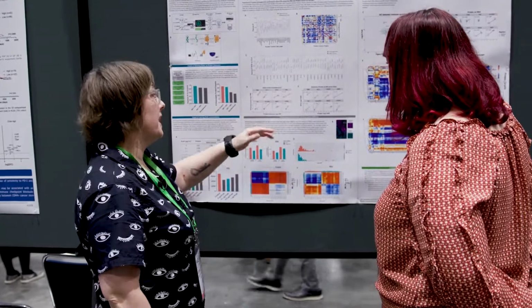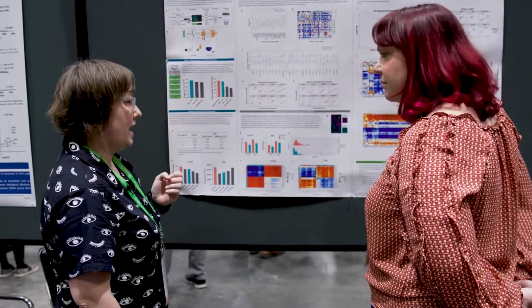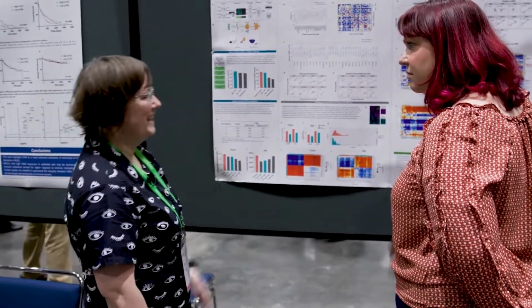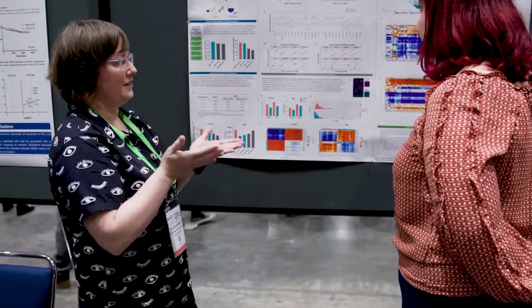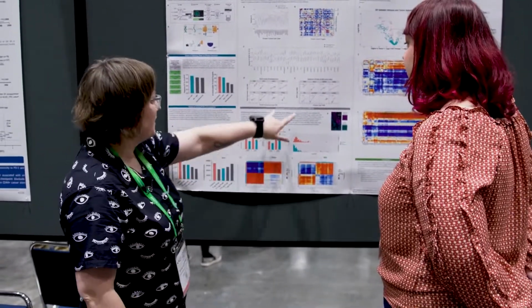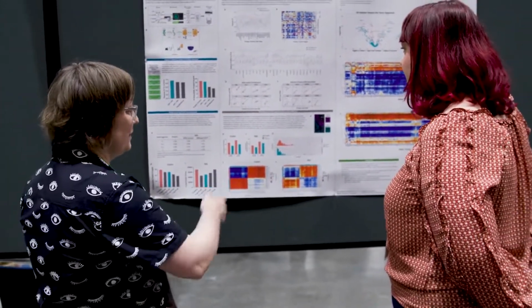I should also say we compared two different approaches: the multimodal, in which you extract data for both analytes from a single slide, and the multi-omic, where you integrate two separate data packages to see how it compares. Which is critical, because why would multimodal be better than multi-omic?